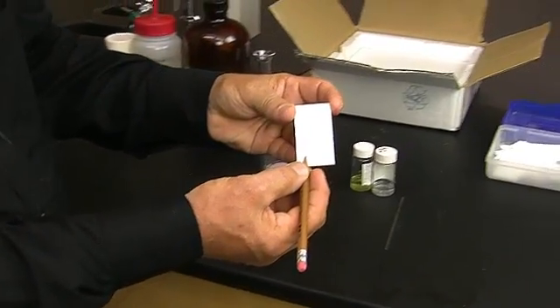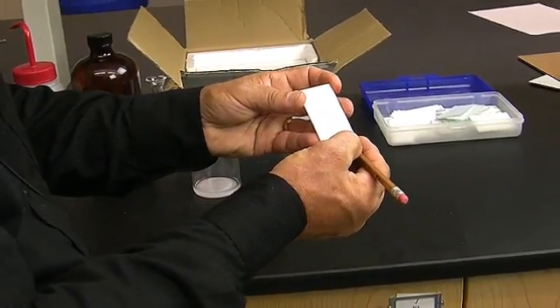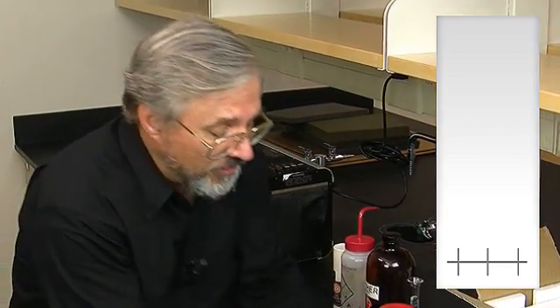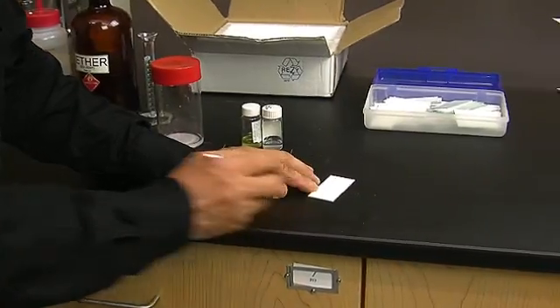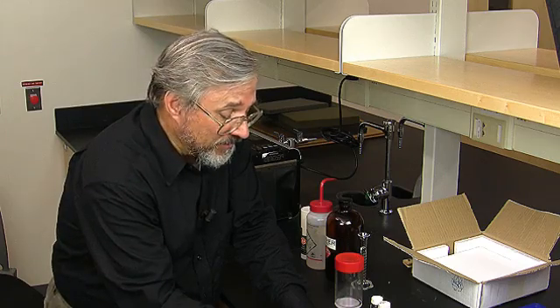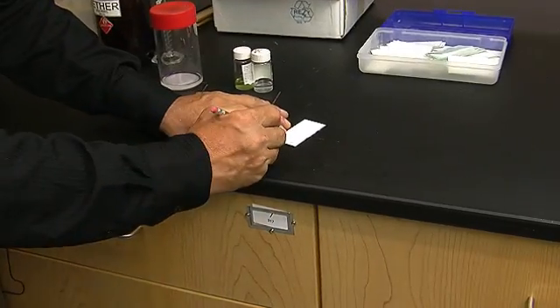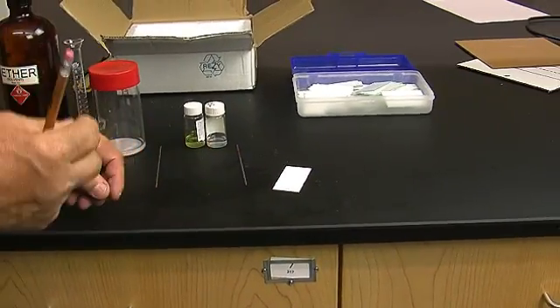We're going to put a pencil mark about a centimeter from the bottom and mark it in three places, not too near the edge. The one on the far left I'm going to mark FL for fluorenone. The one on the far right I'm going to mark B for benzoic acid. And the one in the middle is going to be what we call a co-spot, where I'm going to spot both fluorenone and benzoic acid.